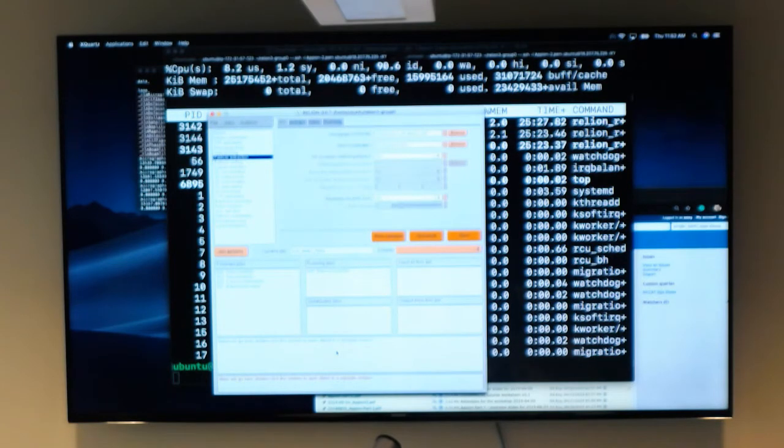It also depends on how much noise you have, because if you have a lot of junk particles that can align to each other, you'll have more than a minimal amount of views, including symmetry. So D3, you'll have a 3-fold and a 2-fold. Technically you might think you have 2 classes, but junk might not actually be random. You might have consistent junk and then additional classes. So you would always specify more.